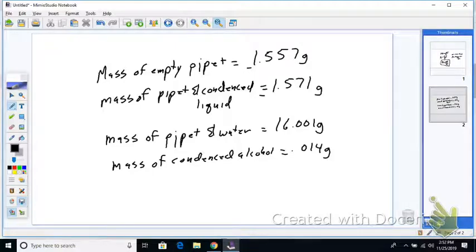So this is the mass of the pipette in water. Okay, so the volume of the pipette, mass of pipette in water. So we have to subtract out the pipette, right? So go ahead and do that. Wait, which one are we doing? Are we doing mass of water and filled pipette? Yeah, mass of water and filled pipette. So what's the mass of the water?